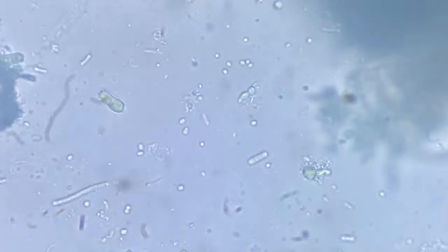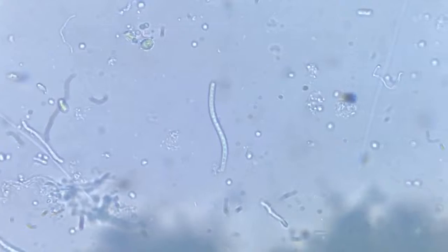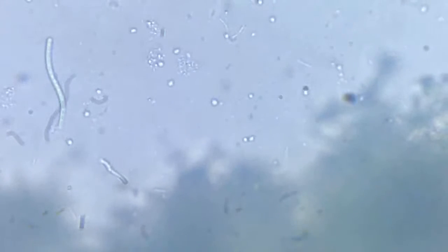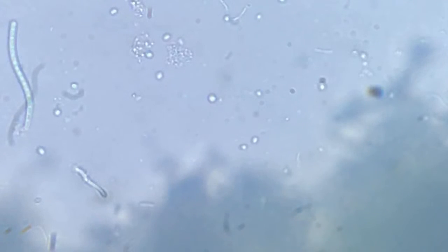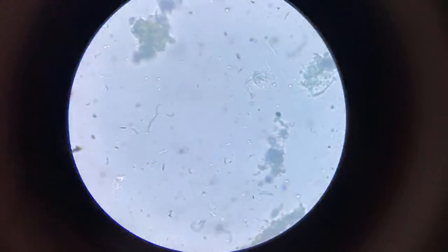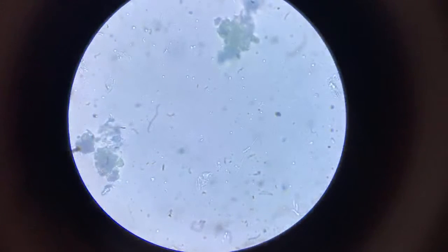I'd seen a Vorticella a while back in the same slide. See, another one going straight up. Let me try and find a Vorticella here, or any other organism for the sake of comparison.